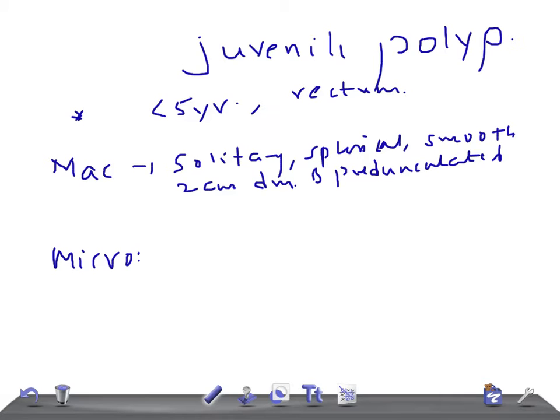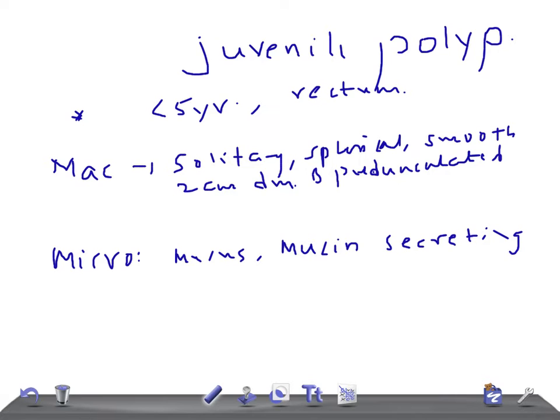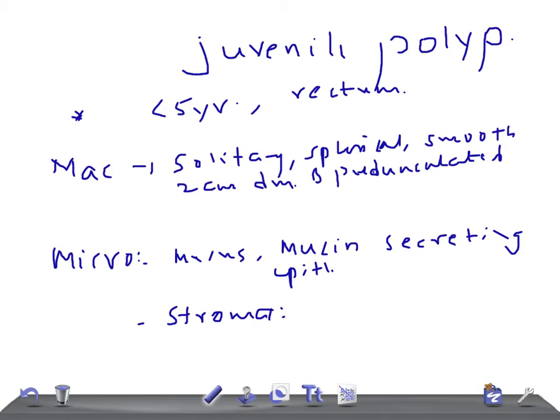Regarding the microscopic examination, if you look under the microscope you see cystically dilated glands containing mucus, lined by normal mucin-secreting epithelium. The stroma may show chronic inflammatory cell infiltrate.